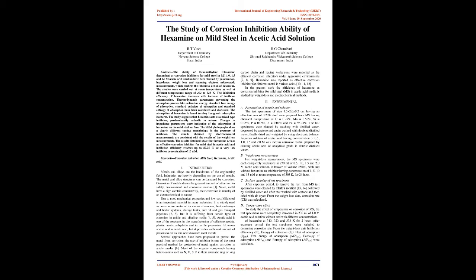Changes in impedance parameters were indicative of the adsorption of hexamine on the mild steel surface. The SEM photographs show a clearly different surface morphology in the presence of inhibitor. The results obtained by electrochemical measurements are consistent with the results of the weight loss measurements. The results show that hexamine acts as an effective corrosion inhibitor for mild steel in acetic acid, and inhibition efficiency reaches up to 87.25% at a very low inhibitor concentration of 15 mM. Keywords: corrosion, inhibitor, mild steel, hexamine, acetic acid.